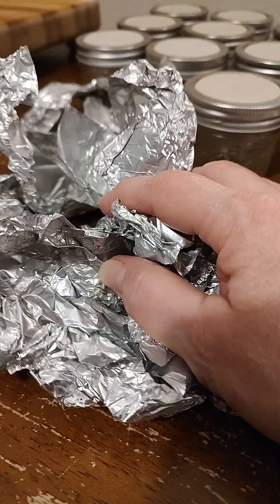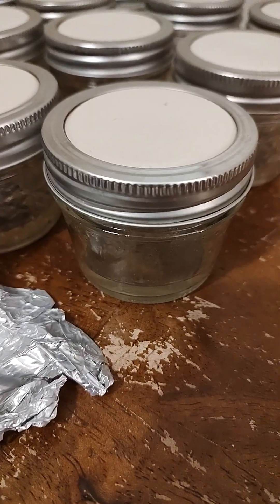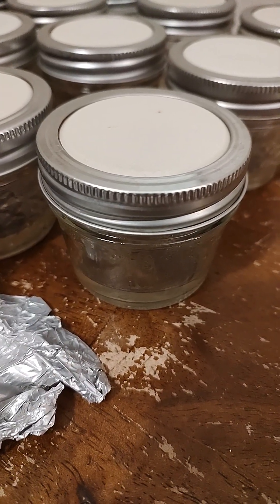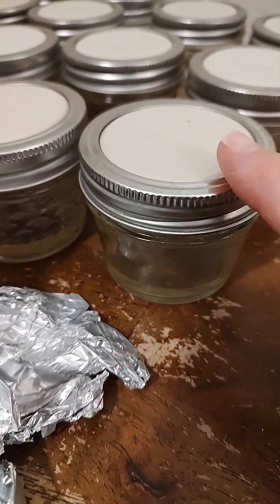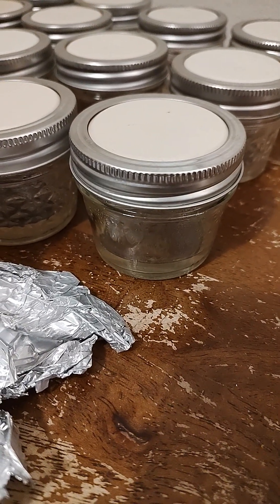The foil is used when you flip the lids so that the water from the pressure cooker doesn't get inside your agar jars. You only need the foil if you flip the lid — it's to help with the condensation. Much love!